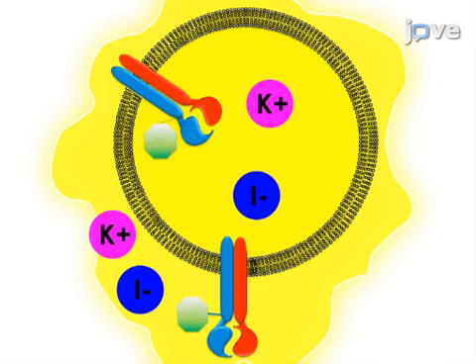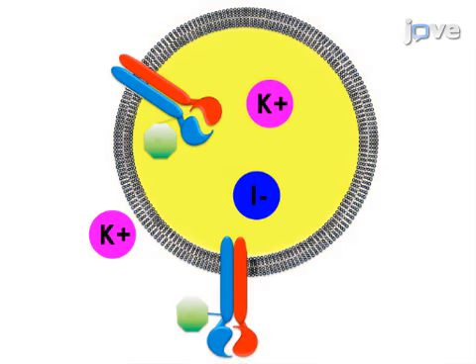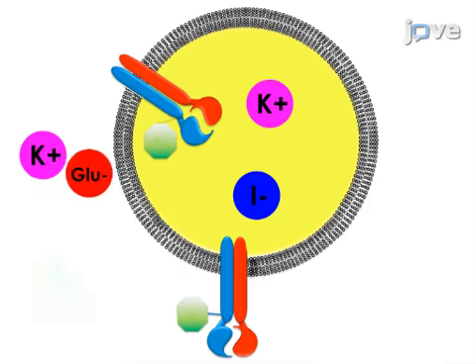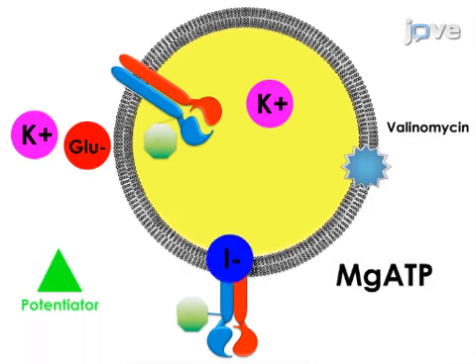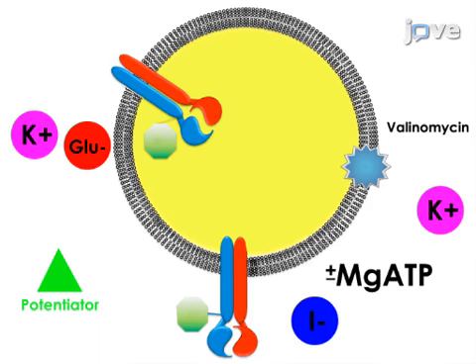Next, a chemical gradient of iodide is developed across the membrane by removing the extraliposomal iodide to generate a driving force for ion movement through the CFTR channel. The final step is to activate the channel and initiate iodide release from the proteoliposomes in the presence of the modulator molecule of interest.